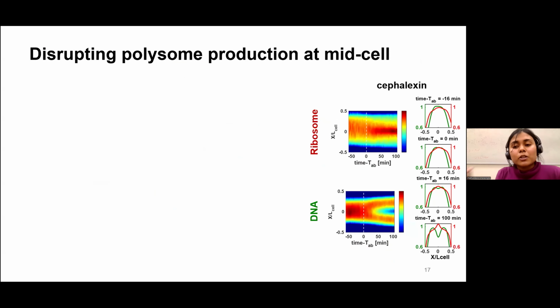To further test polysome-driven nucleoid separation, we stopped polysome production using rifampicin, which is an antibiotic. But first, we'll see how cells behave before the rifampicin treatment. To focus solely on polysome-driven nucleoid separation, we removed effects of cell constriction by treating cells with cephalexin. In these cells, other cellular processes should be unaffected.